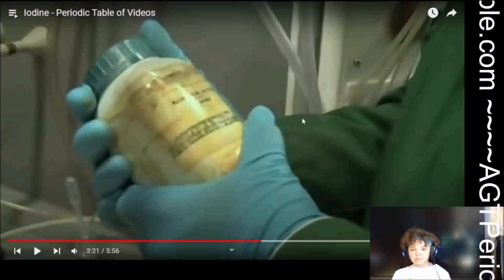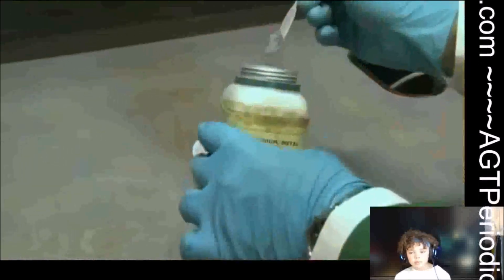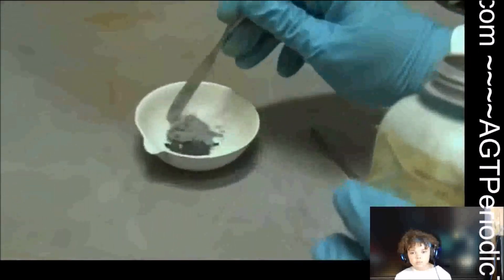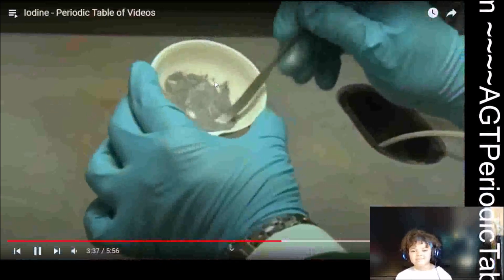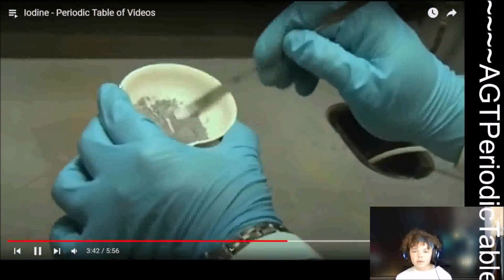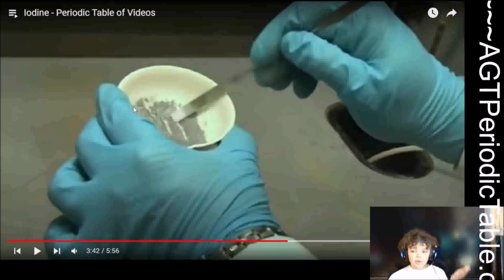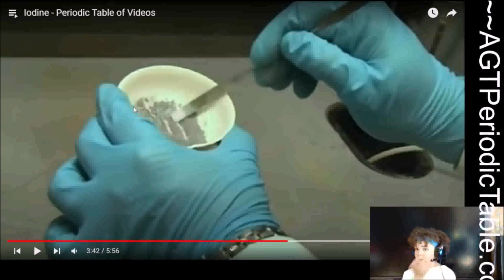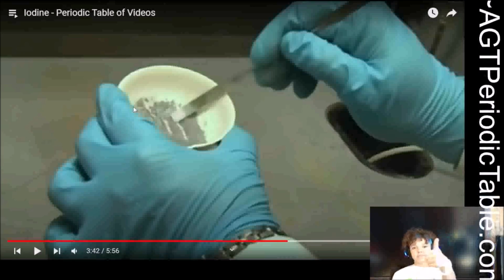We'll find out someday. And we're using very, very finely powdered aluminium, not foil or a rather large lump. This has been specially powdered for us, so again, it has a very, very high surface area. One of my favourite chemical equations is tadpoles plus iodine goes to frogs. So you can see the aluminium and the iodine mixed within this solid mixture. It's a very funny equation. Tadpoles. We add iodine. We get frogs. Good equation.